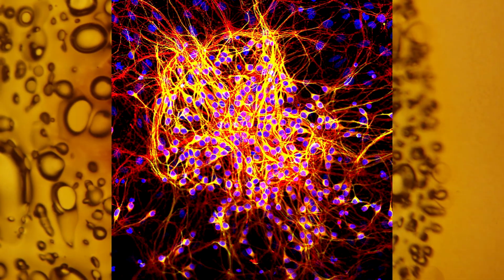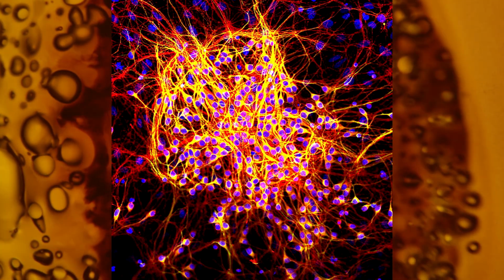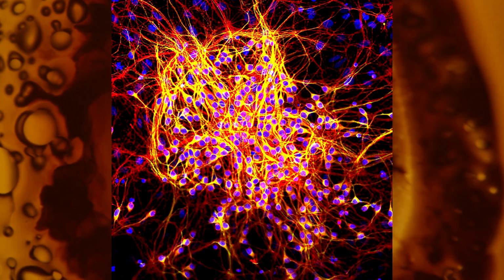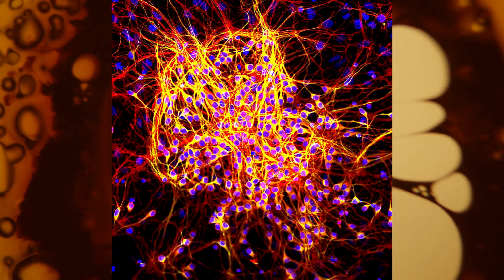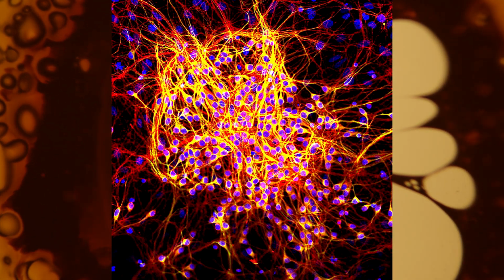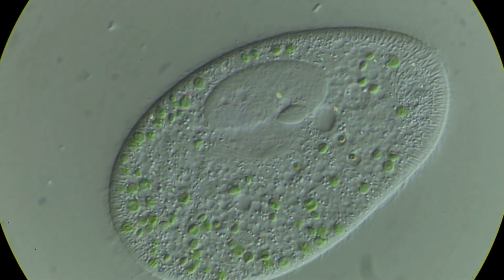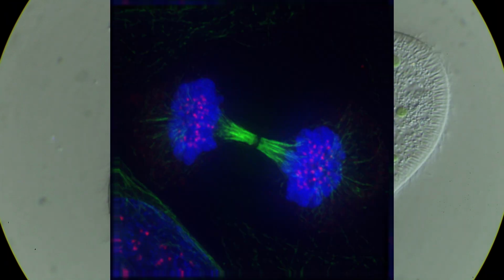For example, it may be part of proving that a certain protein is involved in a specific pathology, or the etiology of a certain pathology. A simple example is the movement of tau proteins in the brain and the presence only in those with Alzheimer's, or the degree of tau bundle formation and dementia symptoms. By itself, this is not enough to establish a model, and certainly not causality, but it is one part of the wider picture. So you might be looking at the end results of your staining.